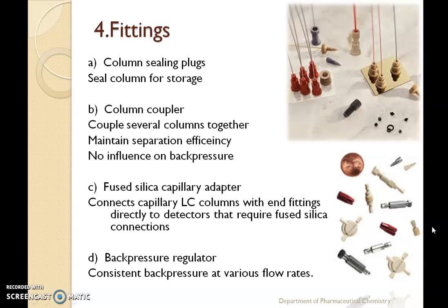Fittings also play a very important role in the column. Column sealing plugs are usually used to seal columns for storage. A column coupler is also used to couple several columns together, so you have to maintain the separation efficiency with no influence on the back pressure.